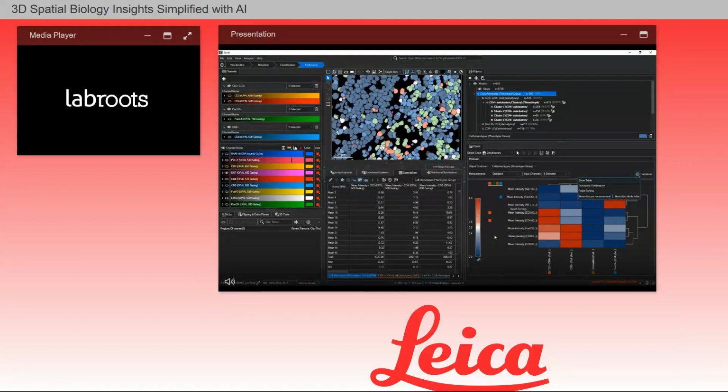One thing that I didn't show you is that the dendrogram is normalized per measurement. You also have the option to normalize the dendrogram using z-score for the entire table in the Options panel. When you hover over a tile, you will get the z-score value.